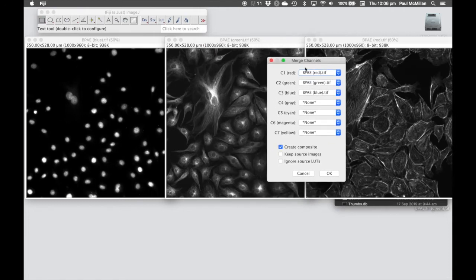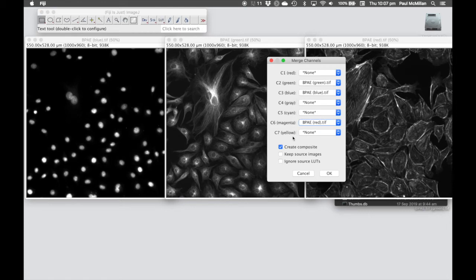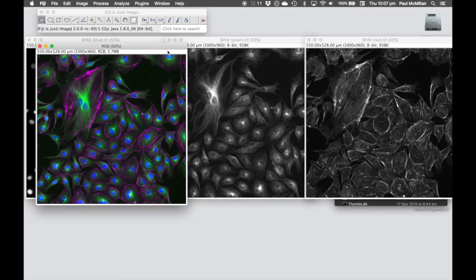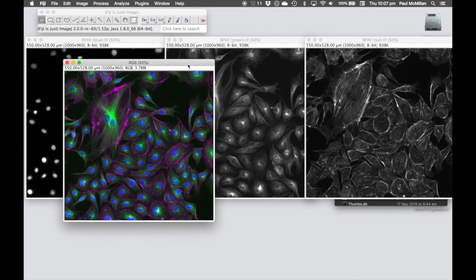Now here we've got seven of the commonly used lookup tables, so blue has been assigned to blue, green has been assigned to green, and red has been assigned to red. But if we don't want that red — if you remember from the earlier talk we want that to be magenta — in this case we don't want to create a composite. You can keep the source images just in case you feel like you're going to mess up. If you hit OK, we now have that blue, green, magenta image that we had previously.